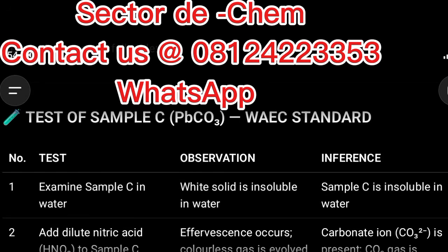This video is strictly for those writing WAEC Practical Chemistry 2026, which comes up on the 20th of this month. So you are expecting that by next week, Wednesday, you are writing WAEC Practical Chemistry. And this Practical Chemistry video is on qualitative analysis, and the result given to you to do the test, observation and inference leads to lead carbonate.